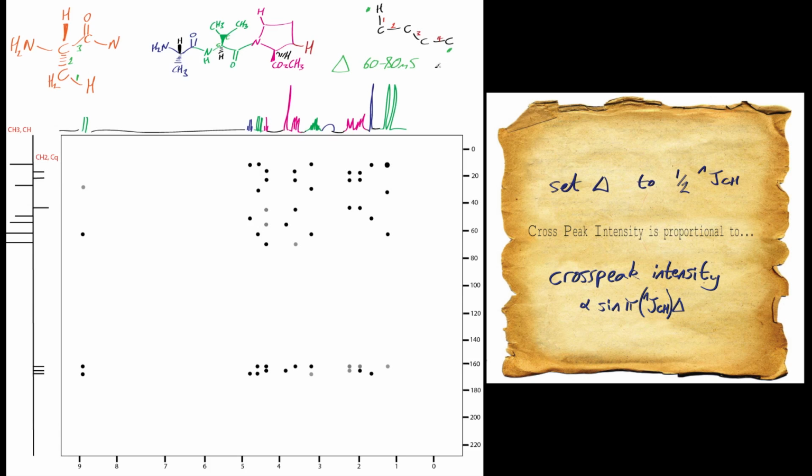If you change that value to about 150 to 200 milliseconds, you will actually see this long range coupling as well. But the downside is that the signals will become quite noisy, it'll take a lot of time to acquire the spectrum, and you also get some artifacts creeping in from the signal generation. So apply that with a bit of caution.